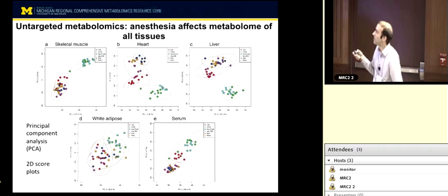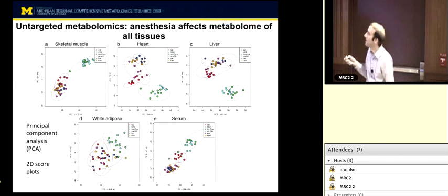And you can compare the extent of that separation by looking at your different groups. So we have a lot of different groups. This is more than typically appear on your principal component plots in a lot of cases. But we have our 6 different modes of anesthesia or euthanasia. CD is cervical dislocation, CO2, isoflurane continuous, isoflurane overdose, ketamine, and pentobarbital.